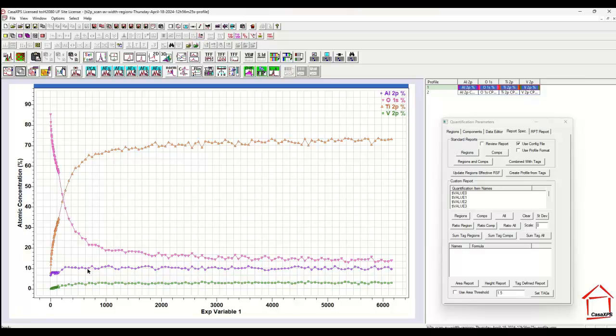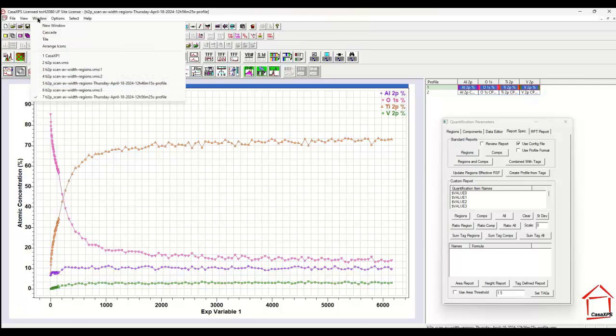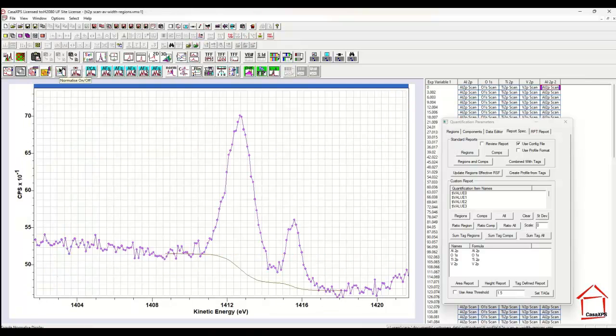So PCA can be used to enhance the appearance of a depth profile that is calculated from a set of XPS data.